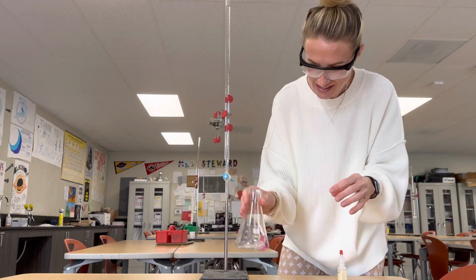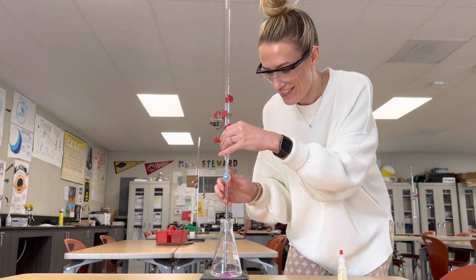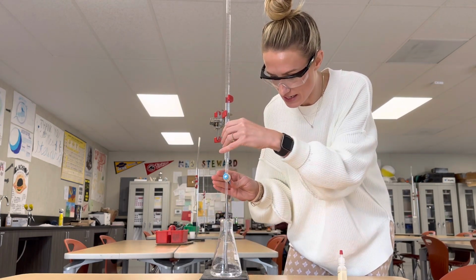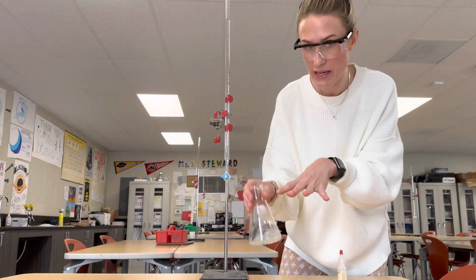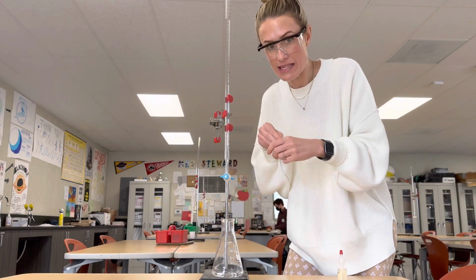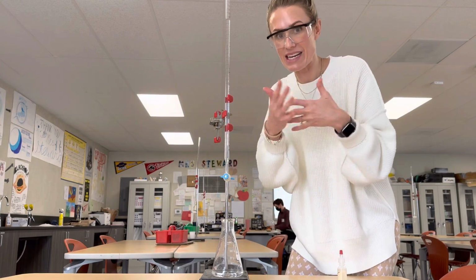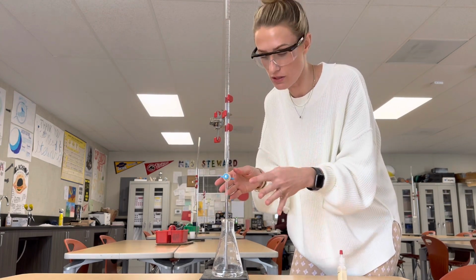And there's my pink and it's disappearing. There's my pink disappearing still. So we're still acidic. We're not basic yet because it's not staying pink. So we can see that it turns pink where I'm actually adding the base, because in that little spot, it is basic. Because again, I'm adding base to the middle of it. Once you swirl it around, that solution is combining and getting evenly dispersed. And so the overall solution is still acidic, which is why it's still clear.